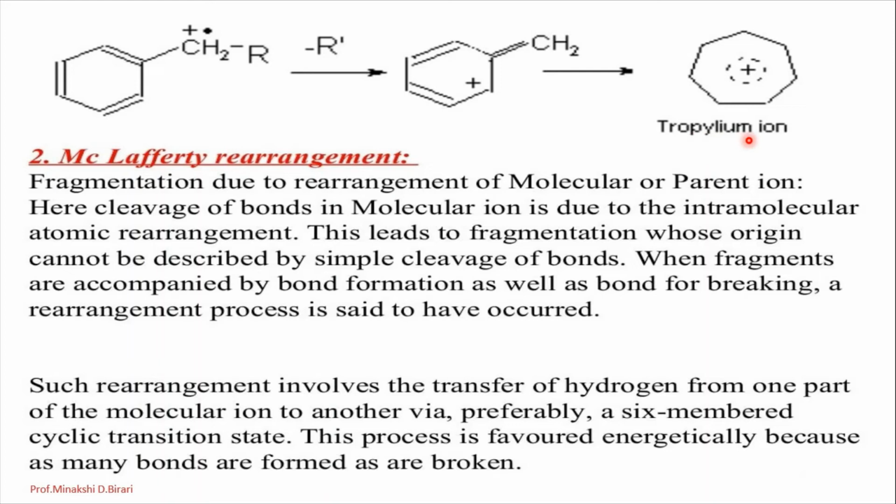A peak is also observed at m/z 91 for the tropylium ion, and here an m/z peak is observed at 92. So this will be the first, scrambling. Second one, McLafferty rearrangement. So what is a McLafferty rearrangement?